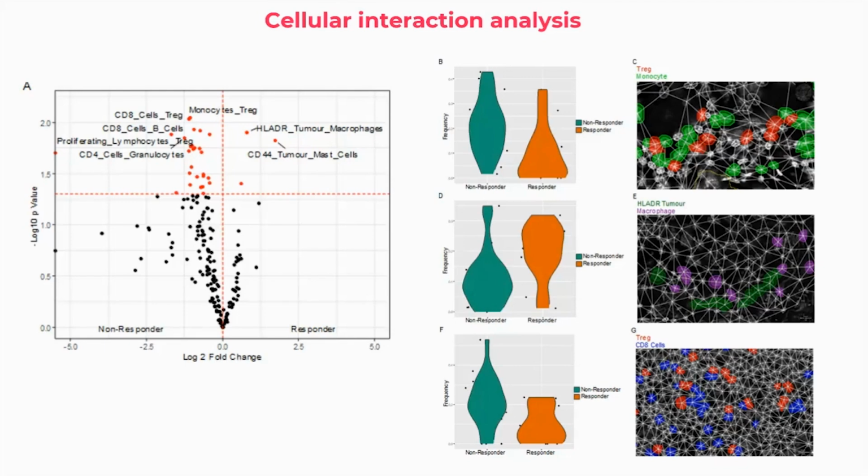And we are trying to get a bit more granular on this and develop spatial scores as a function of distance to or from these cells. And this is linking to a lot of the work that was done by the Nolan lab. But we're using it as a workflow to really demonstrate the proof of principle in our study.